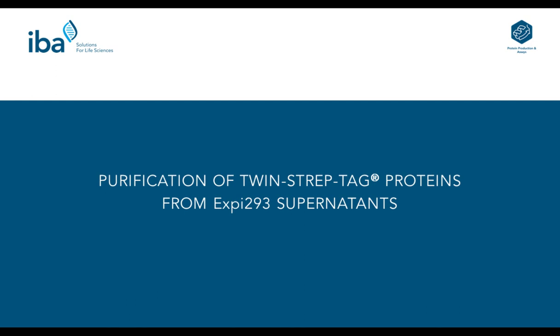So we started a cooperation, and I'd like to thank Temo for this cooperation in providing supernatants for us, and we started with Expi 293 supernatants. Let me say some words about the experiment itself.